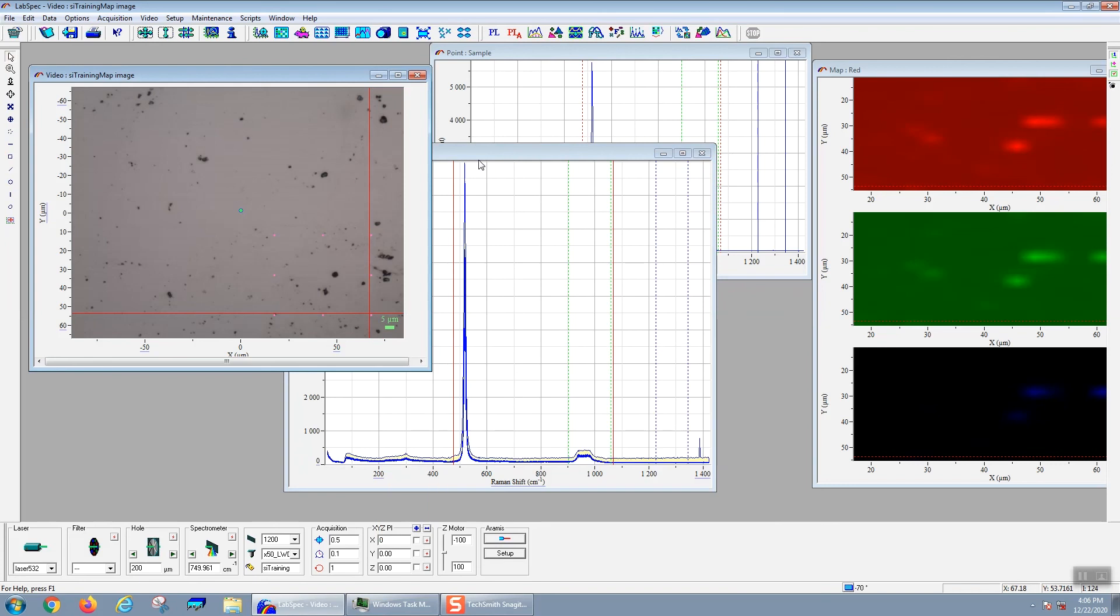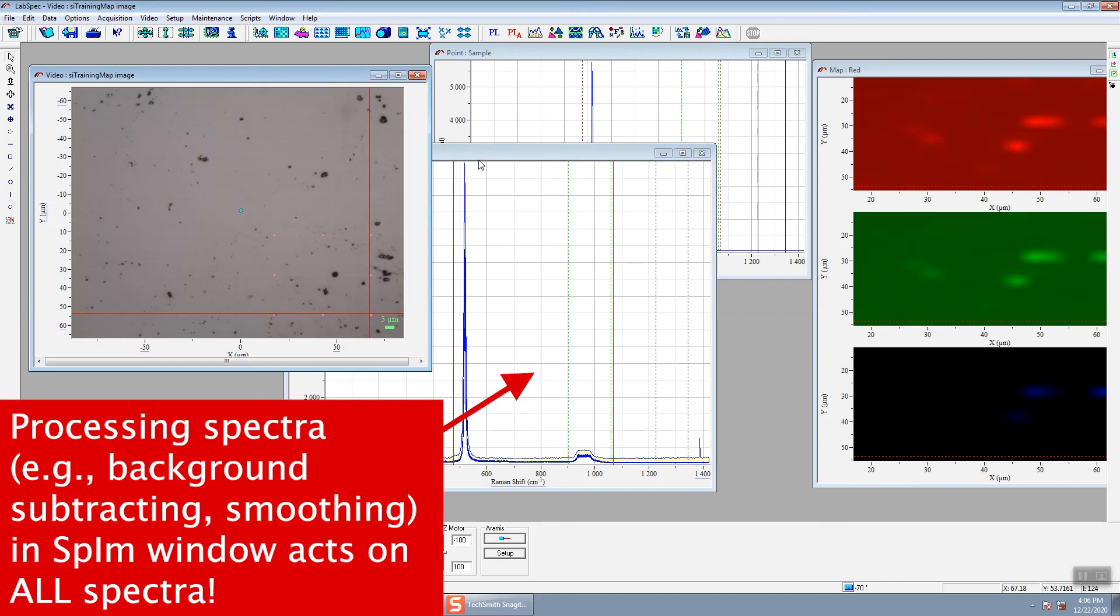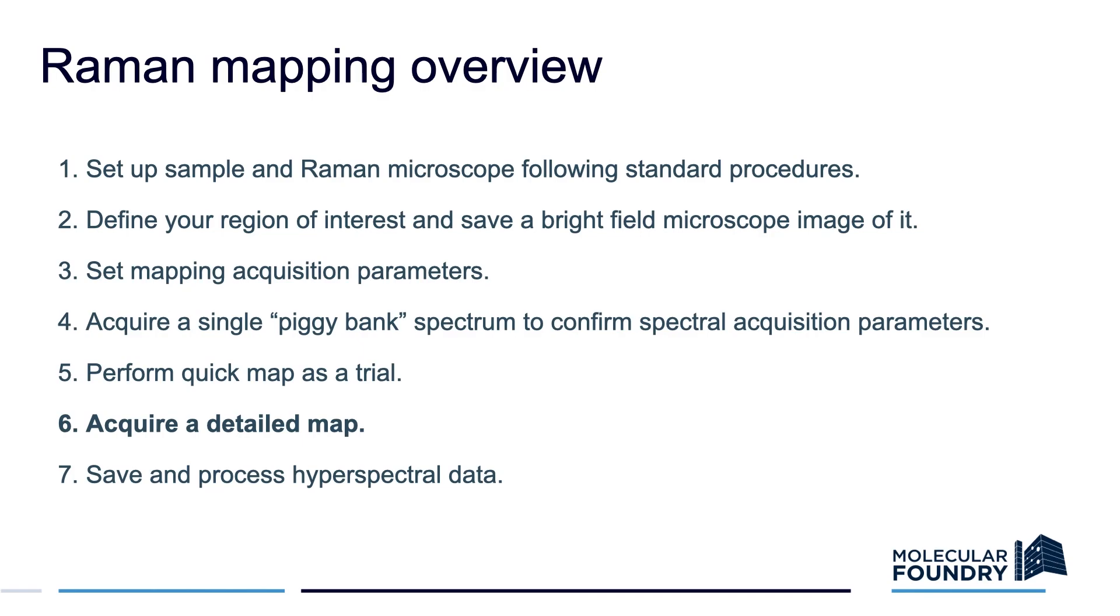You do the processing on the SPIM, so if you're going to do any baseline subtraction or any smoothing, you would do that on the SPIM window because that contains all of your data. Every operation you do operates on every single spectrum. Once you've taken a coarse map, you can then take a fine map where you have smaller pixel sizes, or maybe you change the spectral acquisition parameters to generate higher quality spectra.